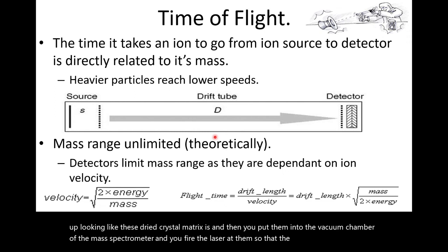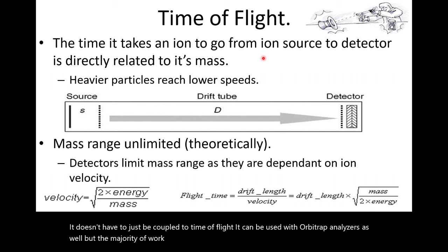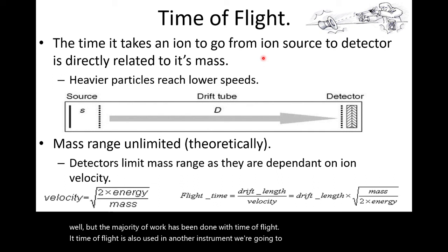Typically, MALDI has been coupled with time of flight. It doesn't have to just be coupled to time of flight. It can be used with Orbitrap analyzers as well, but the majority of work has been done with time of flight. Time of flight is also used in another instrument we're going to talk about in the next part of the series. Time of flight is relatively simple.